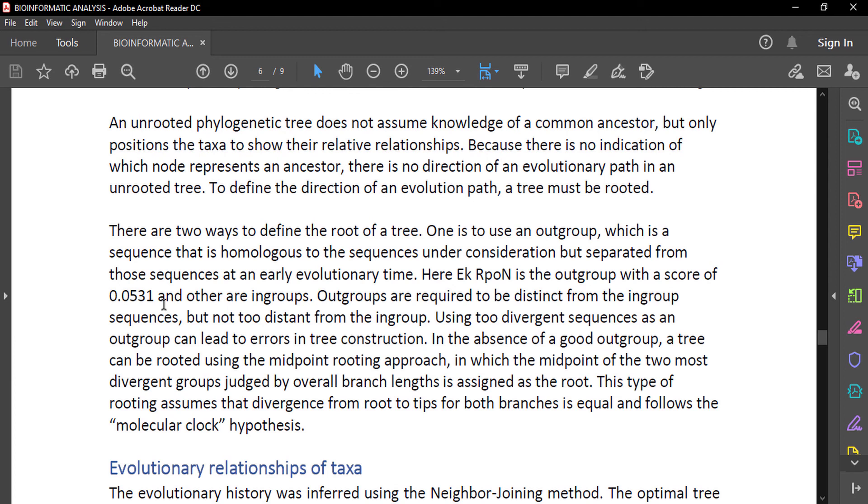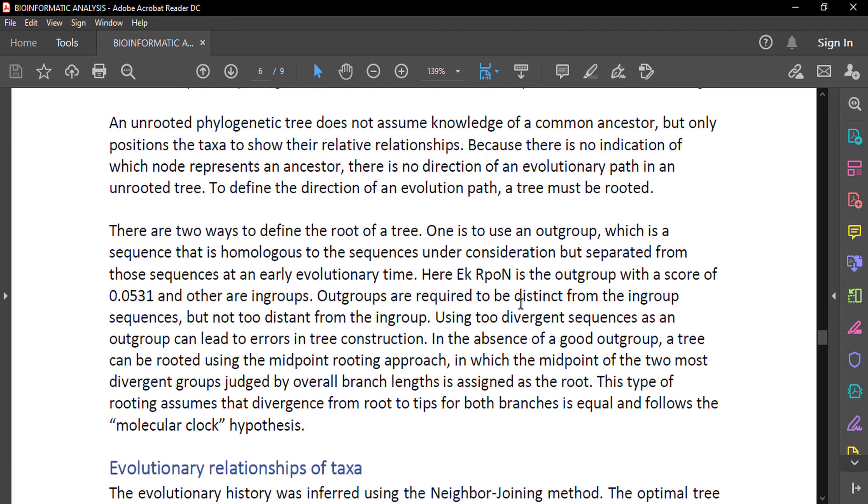Outgroups are required to be distinct from the ingroup sequences but not too distant from the ingroup. Distinct means it is unique from other sequences, but not too distant. If it is too distant from the ingroup, it will be hard to analyze the sequence. Using two divergent sequences as an outgroup can lead to errors in tree construction. In the absence of a good outgroup, a tree can be rooted using the midpoint rooting approach, in which the midpoint of the two most divergent groups judged by overall branch length is assigned as the root. This type of rooting assumes that divergence from root to tips for both branches is equal and follows the molecular clock hypothesis.